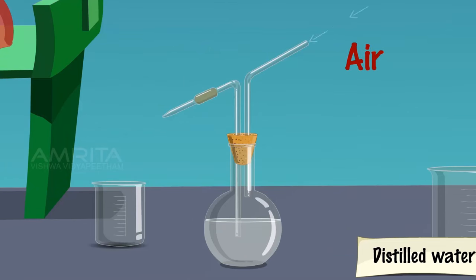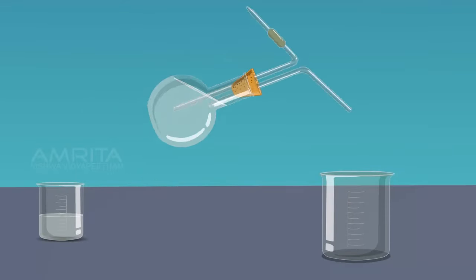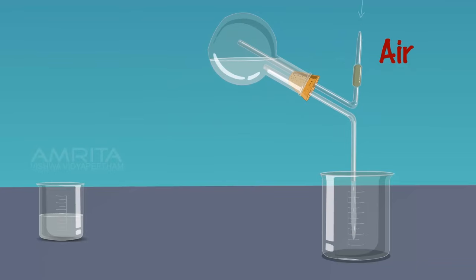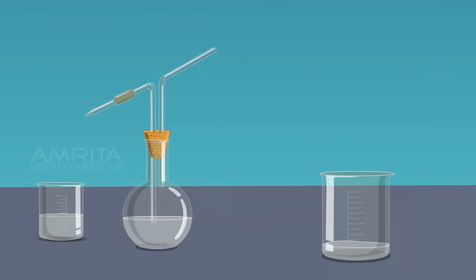On blowing out air through the tube which bends at an angle of 120 degrees, a stream of water comes out from the other tube. On tilting the flask and blowing out air through the tube which bends at an angle of 60 degrees, a little larger amount of water comes out from the other tube.